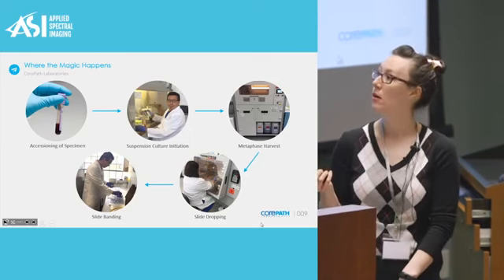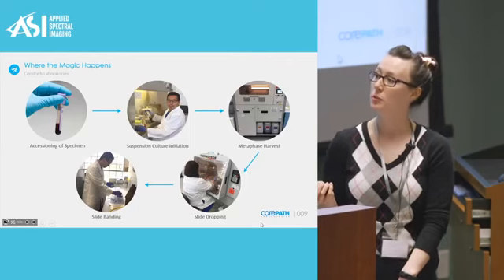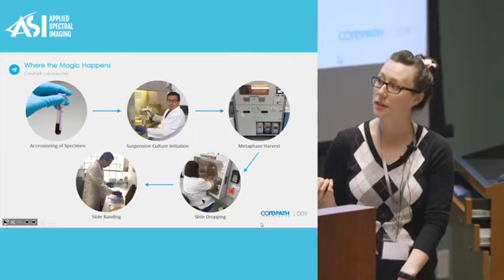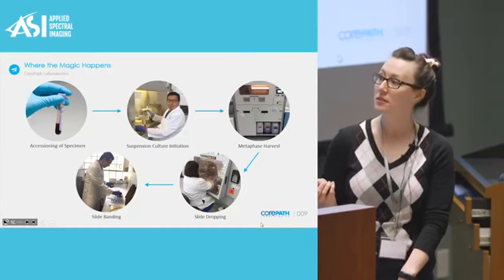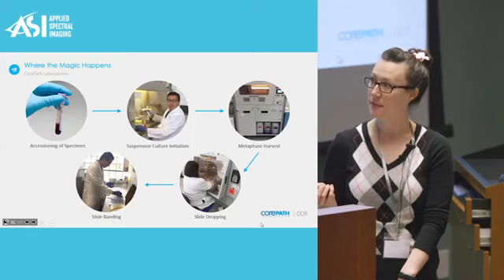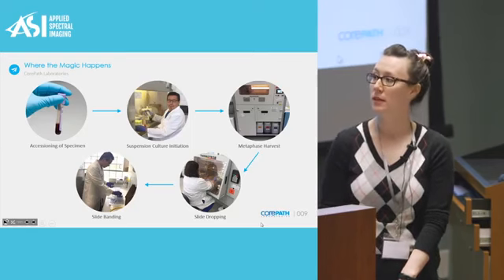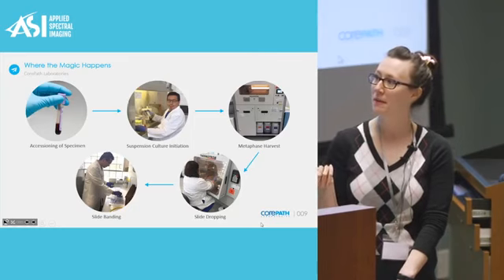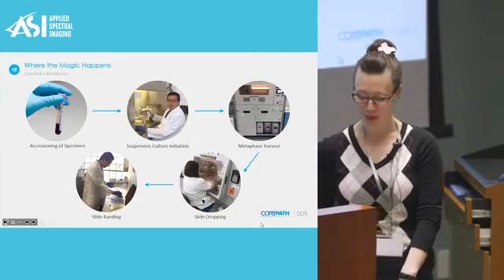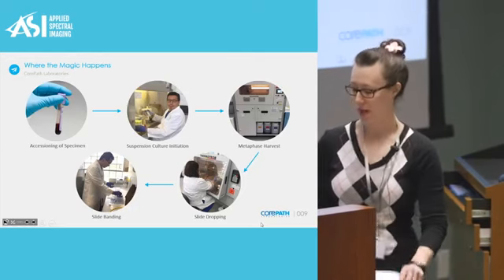Next, once Hannah's done, our specimens will be dropped on glass slides. And this is Valerie. She's busy dropping slides in our thermotron. Once our slides are dropped, they are baked, and then they will move on to banding. We use Wright stain for our banding, and Bo's busy working away. Bo's kind of our culture and our banding guy. And then we'll move on to the magic step.